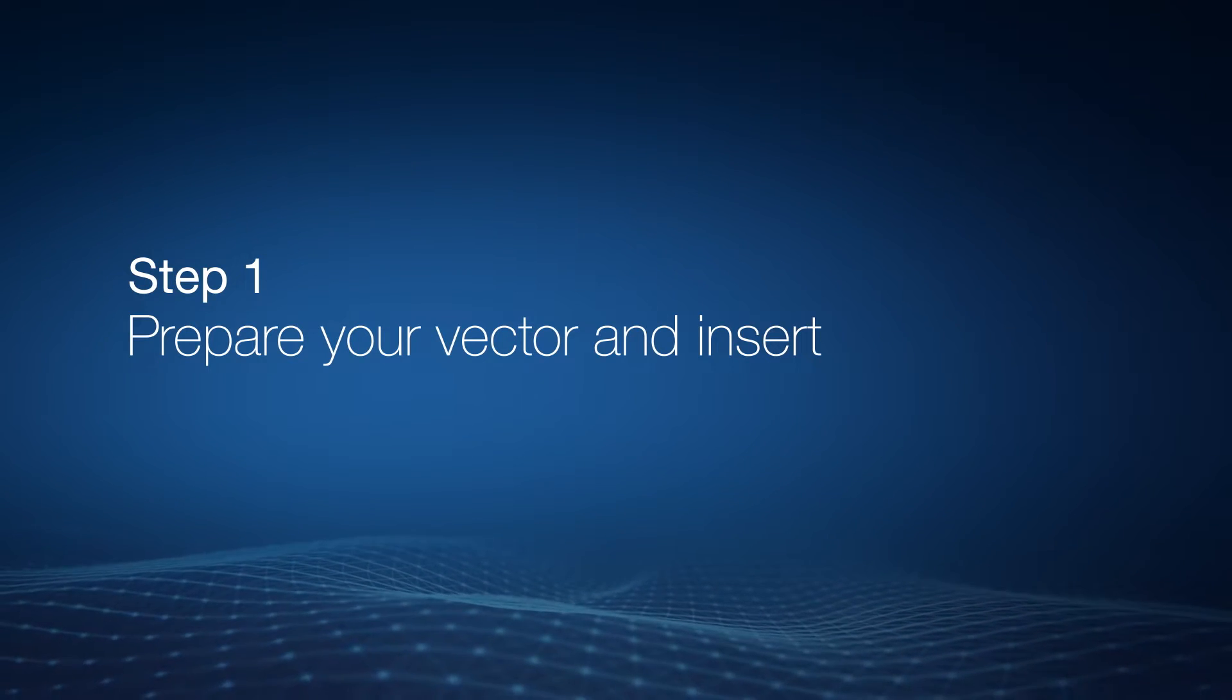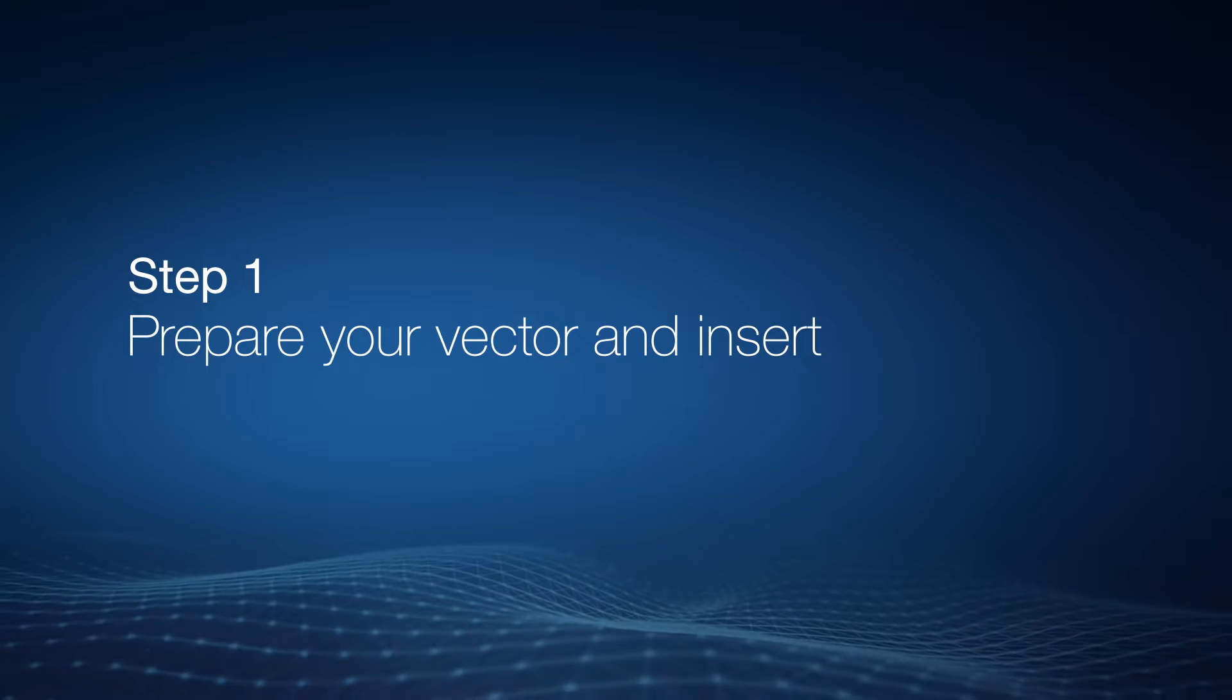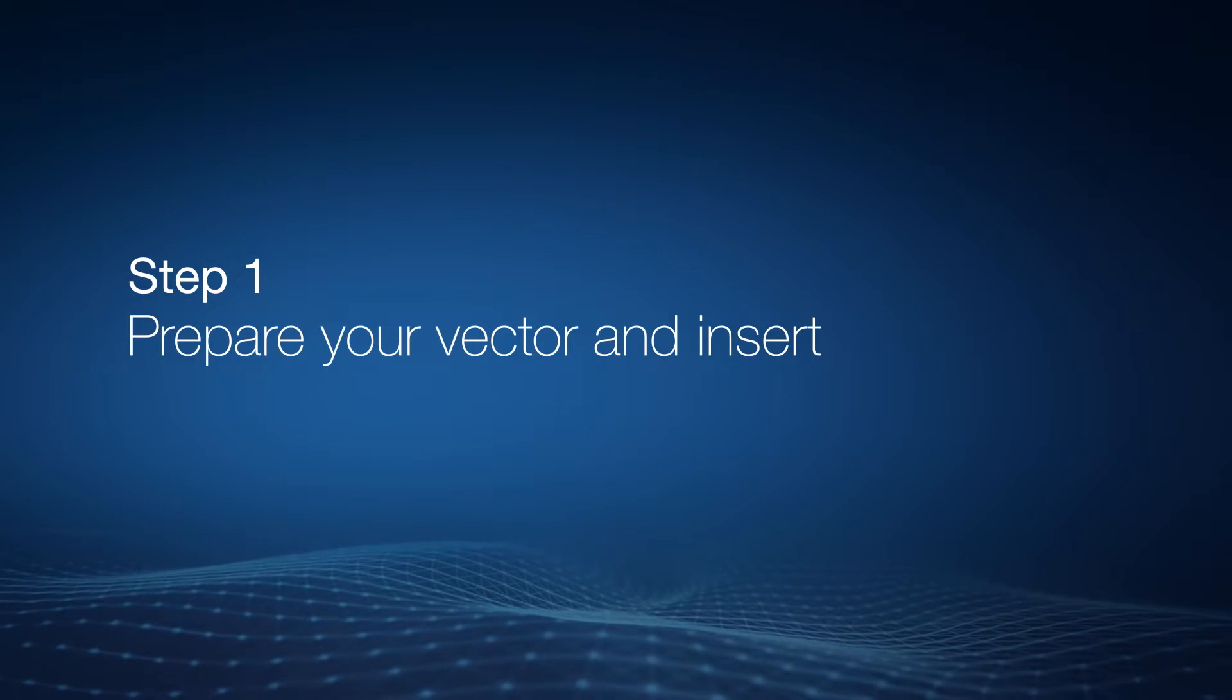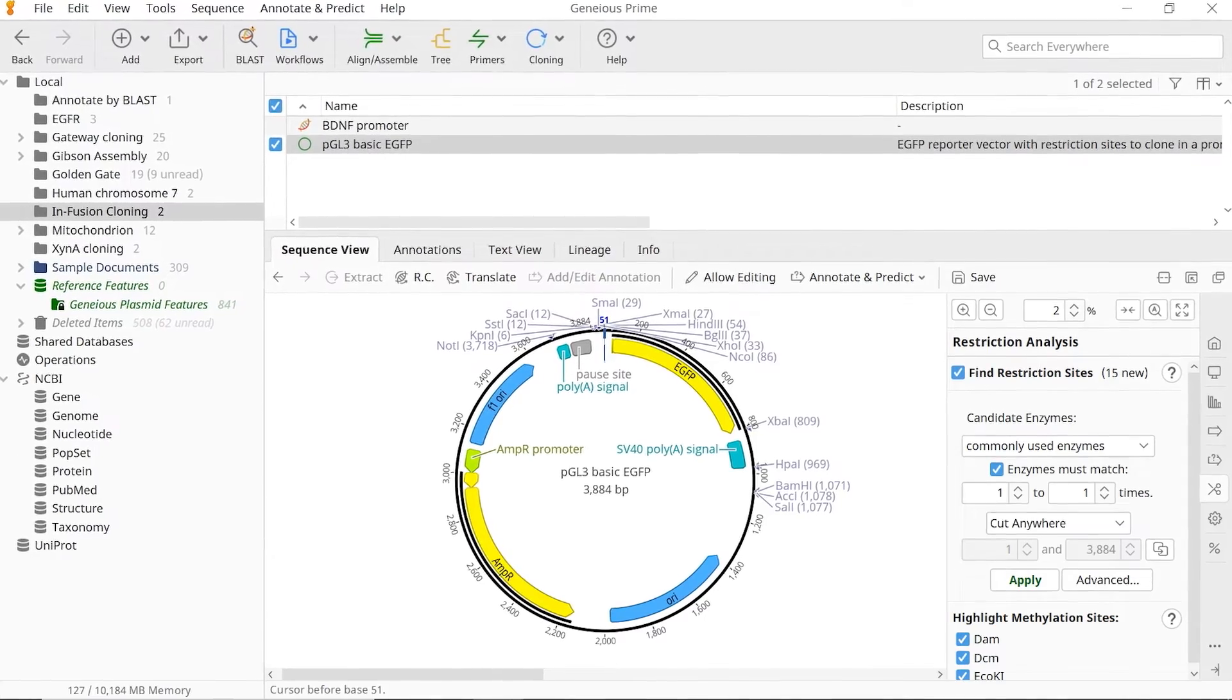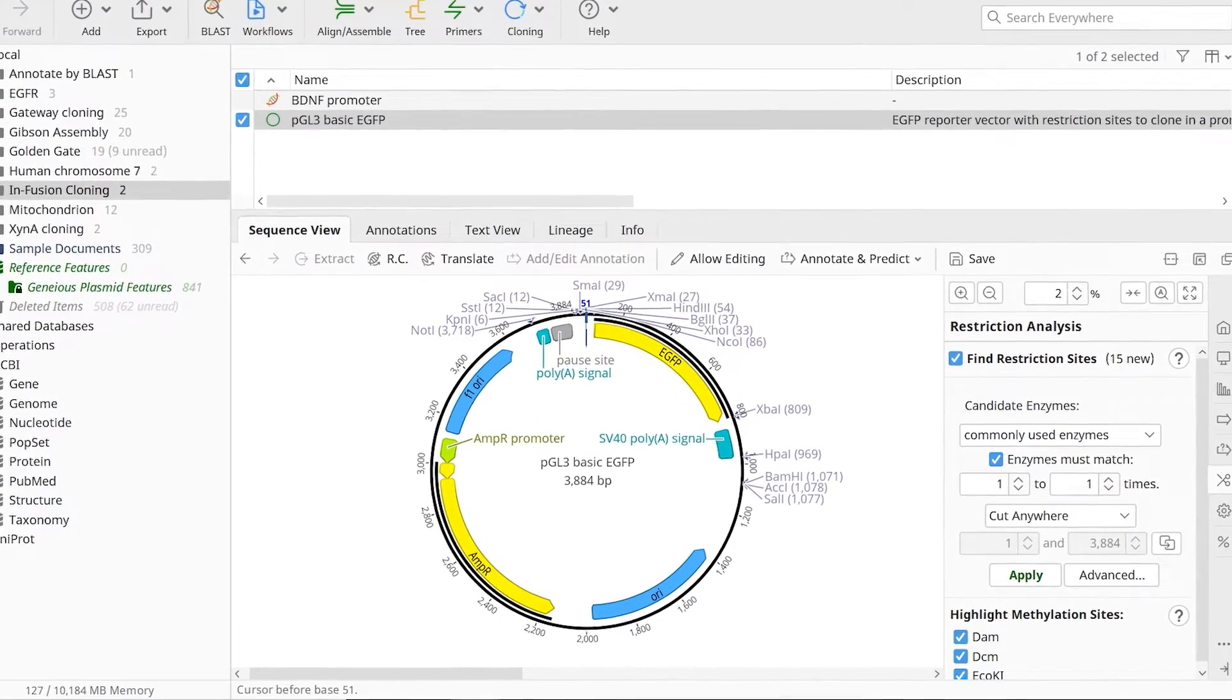The first step is to prepare your DNA fragments for cloning, such as a vector and an insert. Vectors used in infusion cloning need to be linearised first.